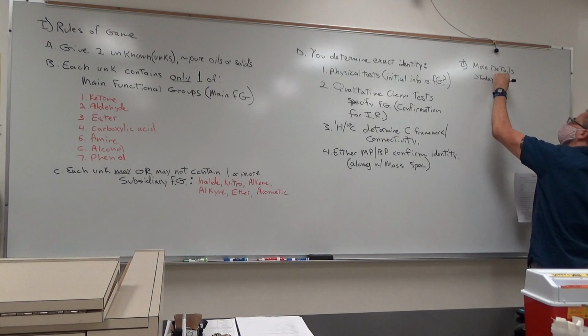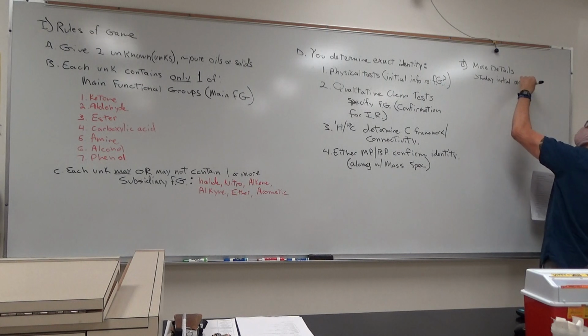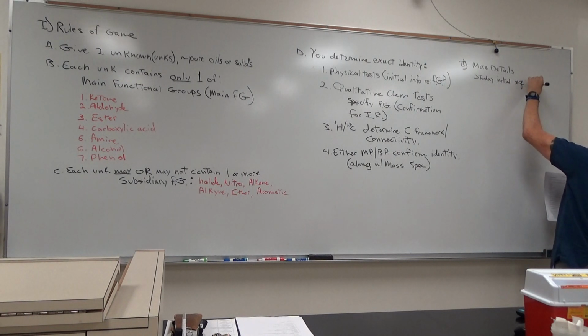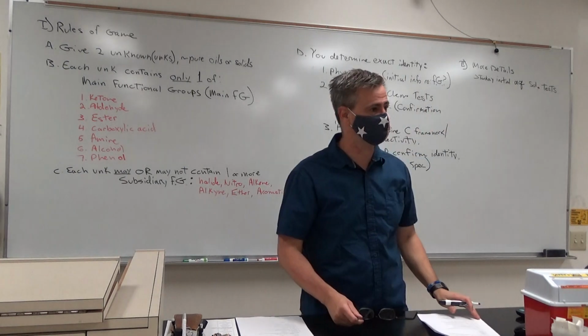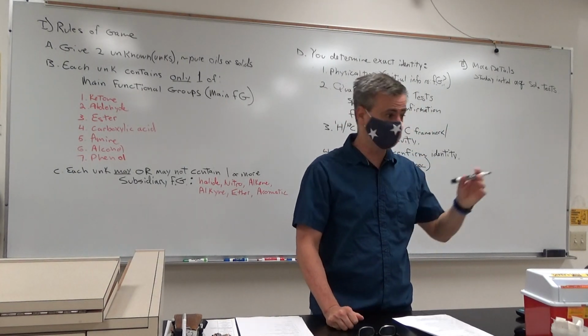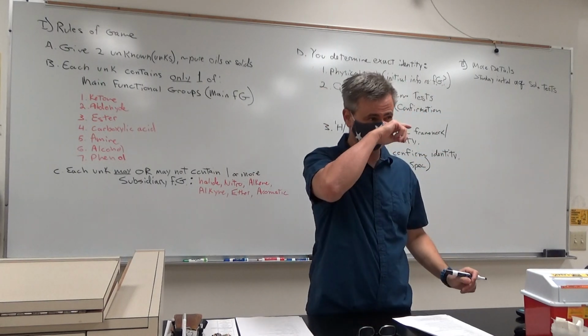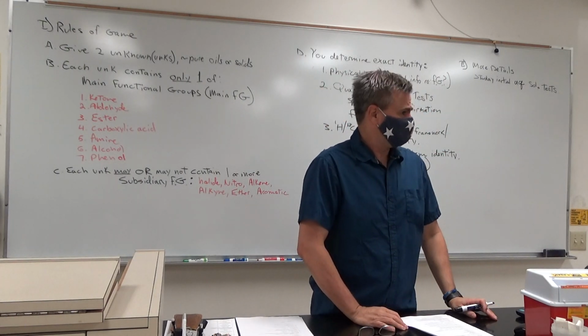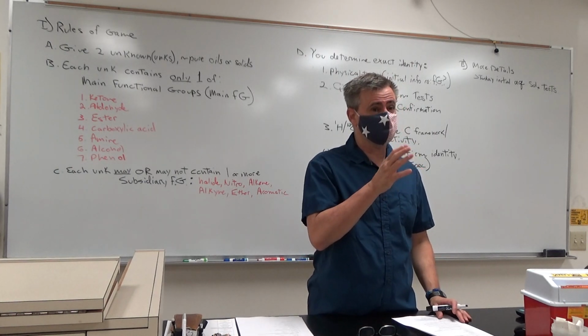Today, the initial aqueous (AQ) solubility tests. Do those just like they're described in the book. Do it twice today, just to get that out of the way and really confirm it. Do one, do the next one, do another one, do the next one. For all the tests, there are standards.